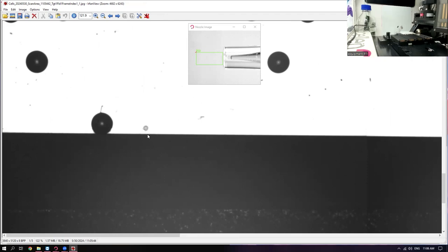And this allowed you to, let's say you thought you made up trypsin, but you didn't. I had a group who had a bottle of formic acid wrapped with aluminum foil right next to their DMSO bottle wrapped in aluminum foil. And so they dissolved their labels in this formic acid. We went and dispensed them and they dried out really quick. And it was like, well, what's this about? And so we were able to see this is clearly not DMSO, right? And so being able to space out those reagents. Also, if you don't have the trypsin, the spot will dry down differently than just a buffer spot, just because of the excess material in there.